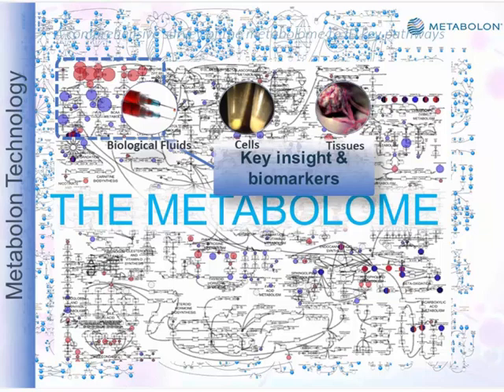So, I've talked a little bit about this, but this is our biochemistry wall chart that we've developed, and now we're getting a pretty complete picture of all this biochemistry. With the precision and the breadth of what we're measuring today, we can actually look at clinical samples now and look at an individual and how they deviate from an average normal population. So that's something that's very new.